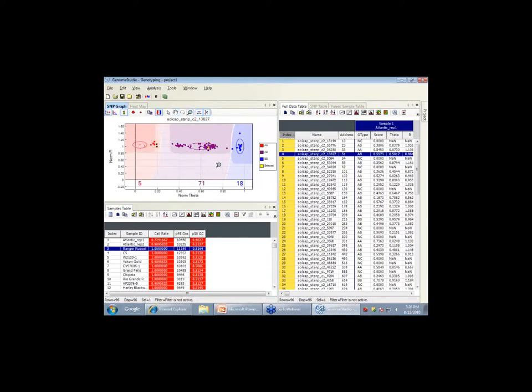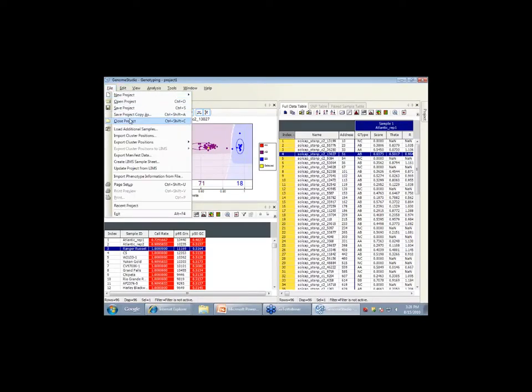And so now I've changed from the automatic clustering file. What I'm going to do is export this cluster position. So this is what, say, SolCAP will do. We'll define all the clusters, and we're going to export cluster positions.